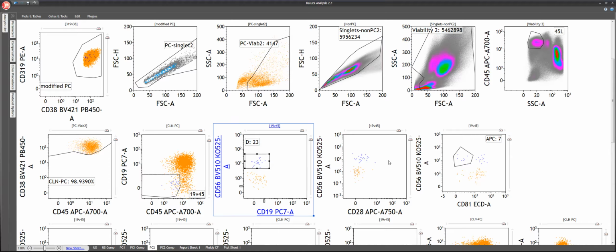Compared to the earlier tube, this type of difference we usually note when we look at cytoplasmic versus surface tube processing, because in cytoplasmic processing we lose some cells. We can lose some normal plasma cells, some abnormal plasma cells, or some granulocytes, so some variation can be noted.